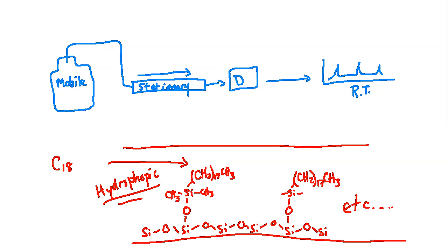There's a lot of containers or boxes for this instrument that are stacked on top of one another. So I made a rough sketch of an HPLC setup. It's very generalized, but it'll get the point across as we're talking about this. So let me bring that up and we'll take a look at that together.